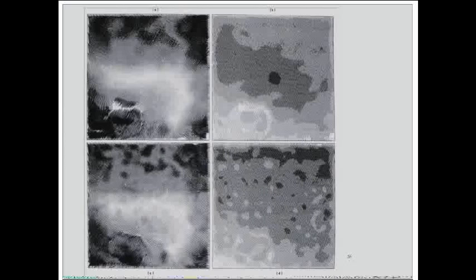And this is after several steps of correction for defocus and astigmatism and allowing for the tilt angle. And now you find that the best parts of the crystal are actually all the way up here. So you get a much broader high correlation across the image as you go through cycles of unbending and defocus and astigmatism refinement.